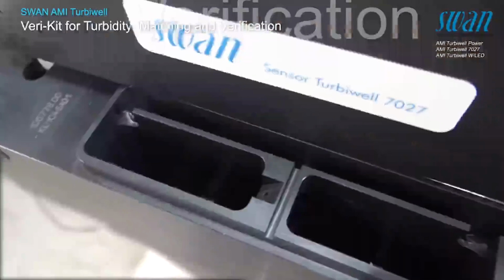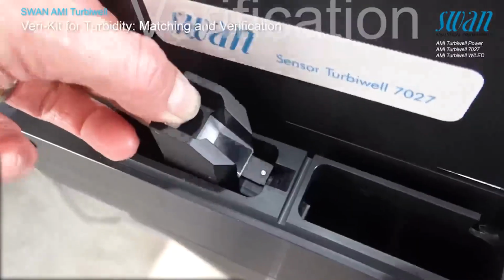To avoid misting of the glass prisms, make sure that the VeriKit and the measuring chamber have the same temperature.